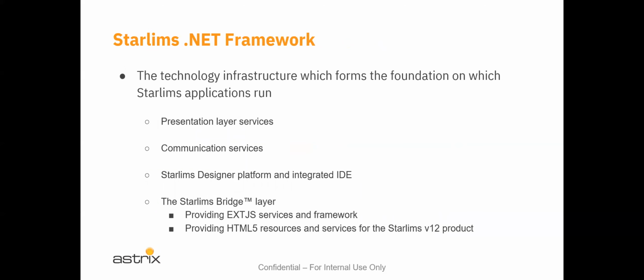STARLIMS uses the .NET framework. It's the technology infrastructure, and it forms the foundation on which the STARLIMS applications run. And it handles the presentation layer services. It handles the communication services. It handles the STARLIMS designer platform and the integrated IDE. And we'll talk a little bit more about that in a training tomorrow. But suffice to say that STARLIMS is ultimately customizable. It also handles the STARLIMS bridge layer, which provides the extended JavaScript services and framework and HTML resources for the latest STARLIMS v12 product.